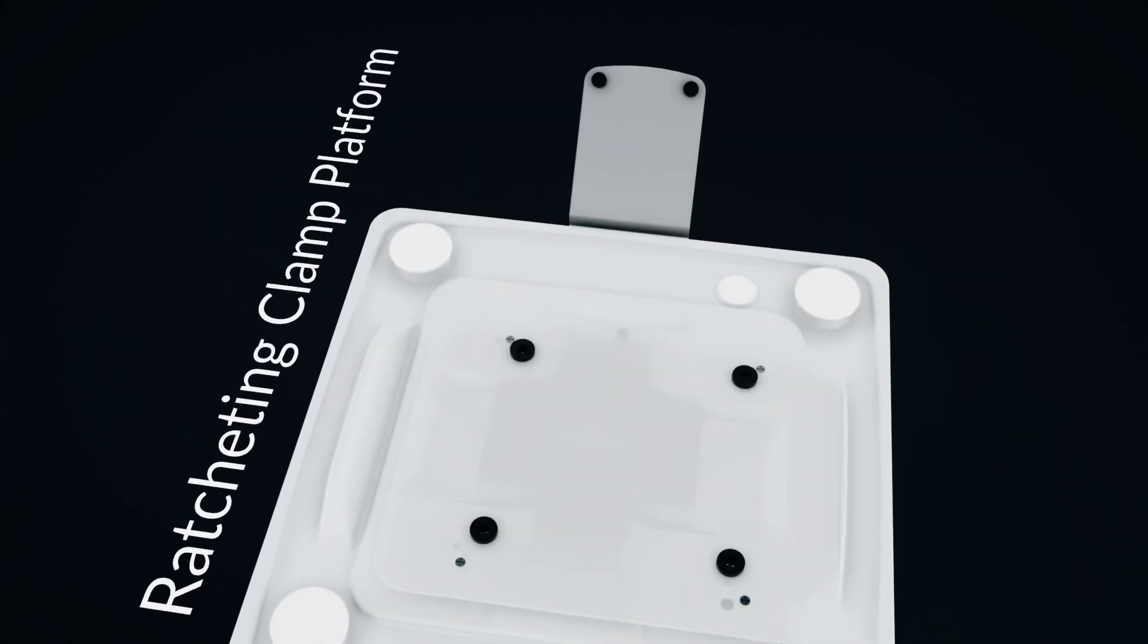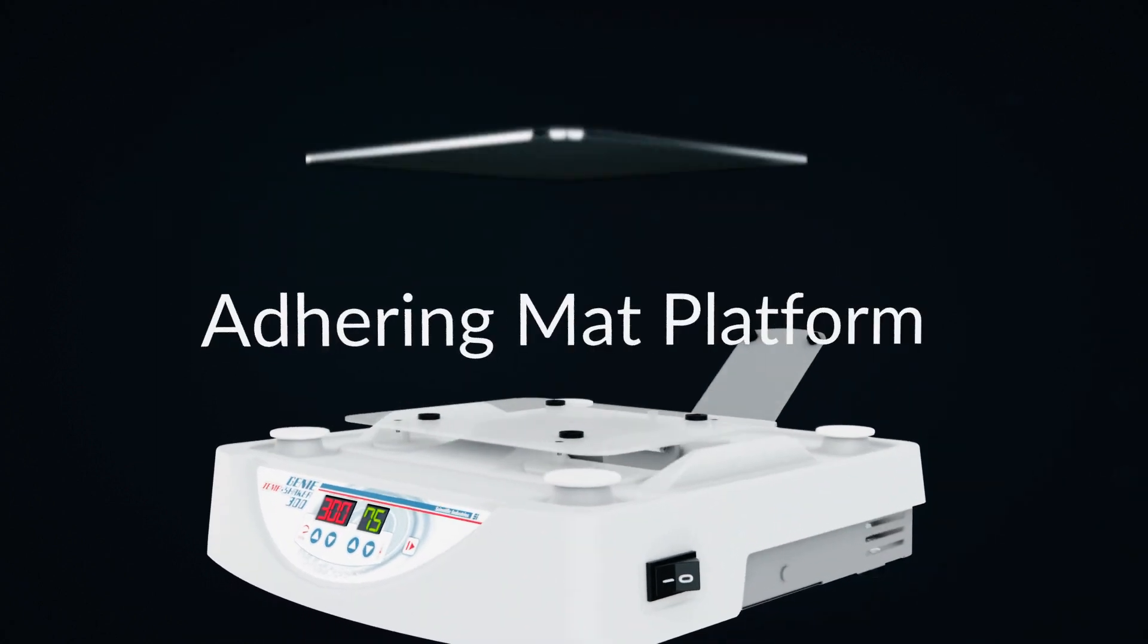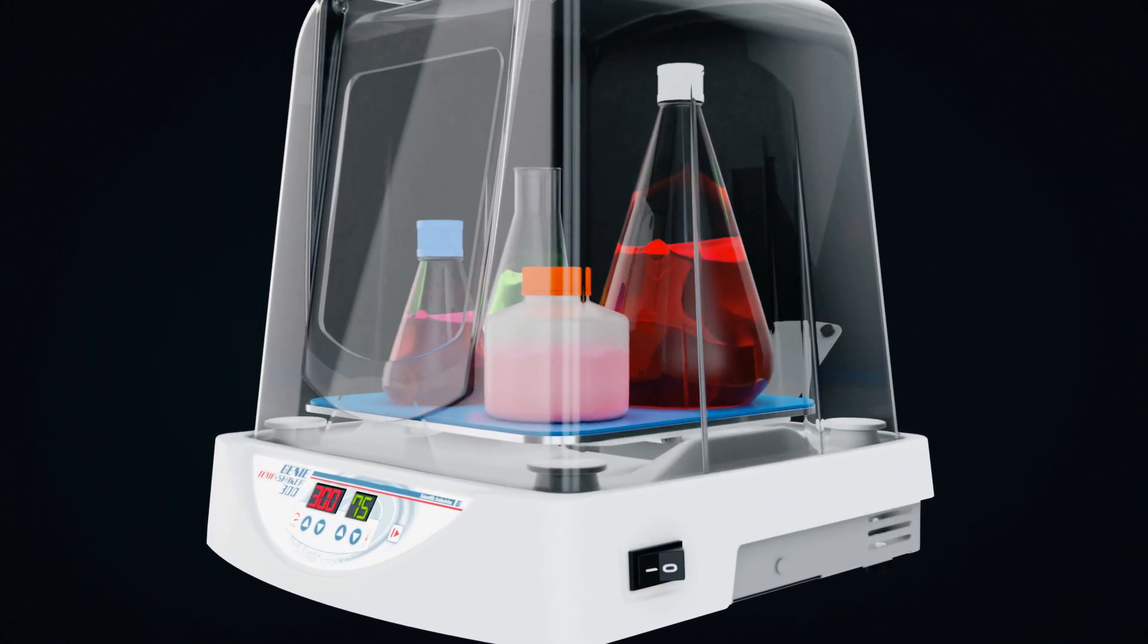Quickly switch to the universal ratcheting clamps for oversized containers or attach the adhering mat to securely hold your samples without clamps.